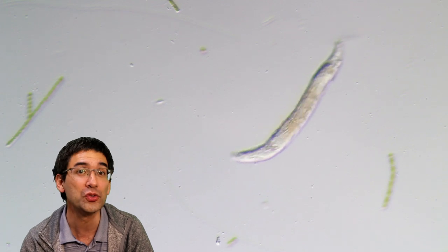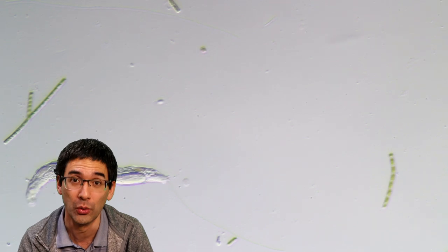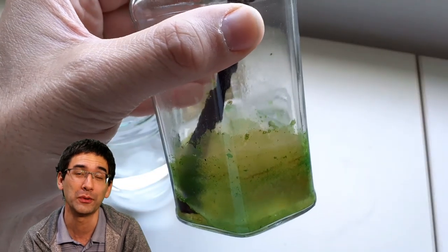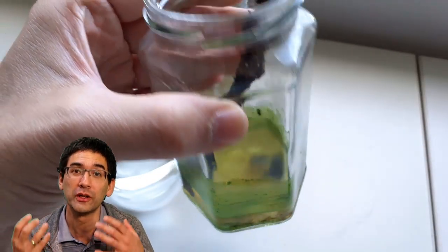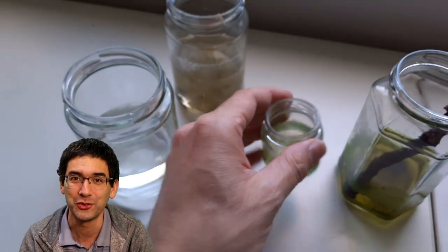I do recommend that you use inorganic fertilizer and not organic, simply to keep the bacterial count low. I think it's also important that you're actually enriching only those organisms that you actually want to observe, not just anything.